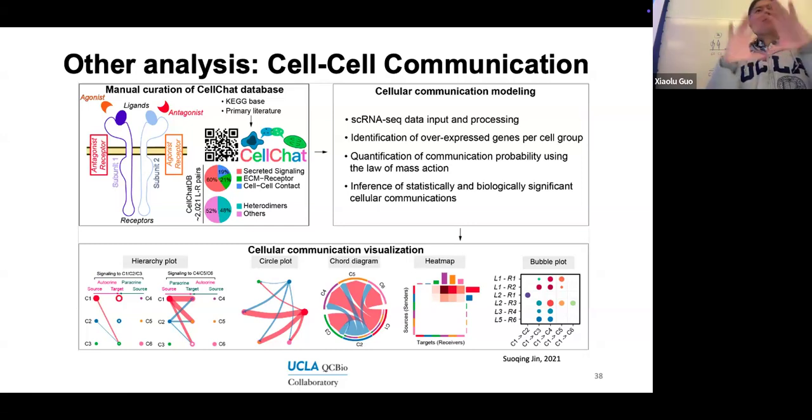For example, the macrophage senses immune threats, and it's like a leader: it detects bacteria, virus, or damaged tissue, and then it tells other cells, oh, here is an immune threat, come join me, let's defeat this together. So that's what cell communication analysis can help us understand, to really see how cells coordinate with each other.